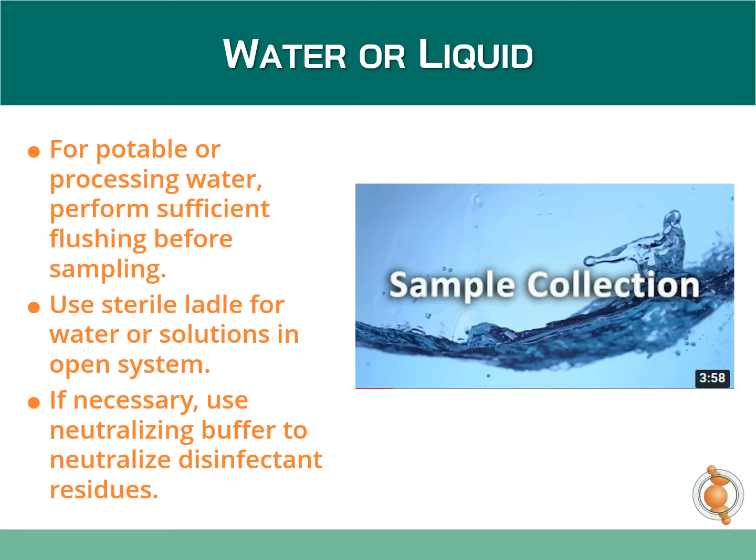For sampling potable or processing water, perform sufficient flushing before sampling. Use a sterile ladle for water or solutions in open systems. If necessary, use neutralizing buffer to neutralize disinfectant residues. Please visit the AEMTEK YouTube channel for instructions on how to take potable water samples.